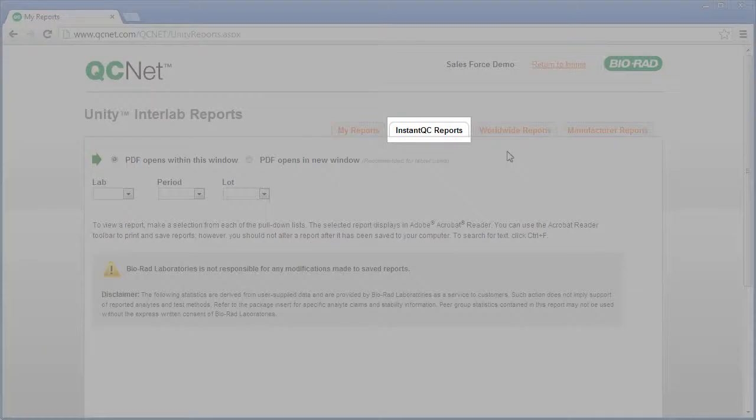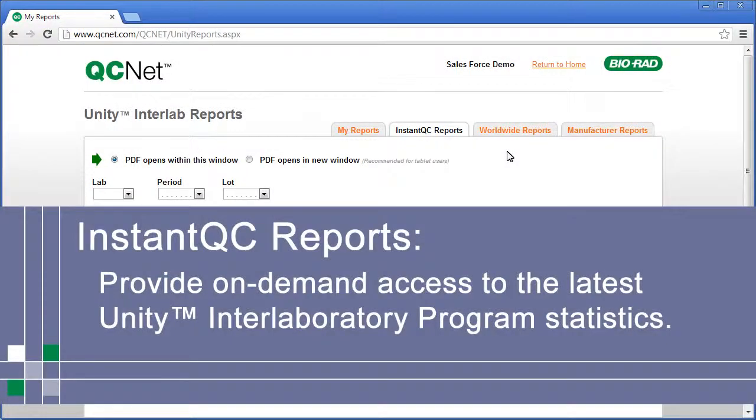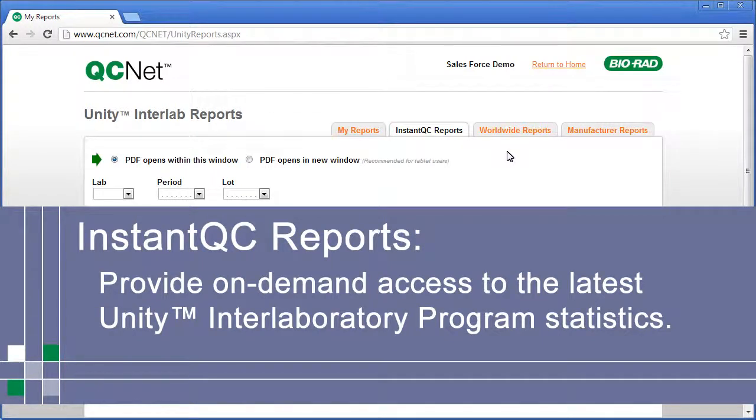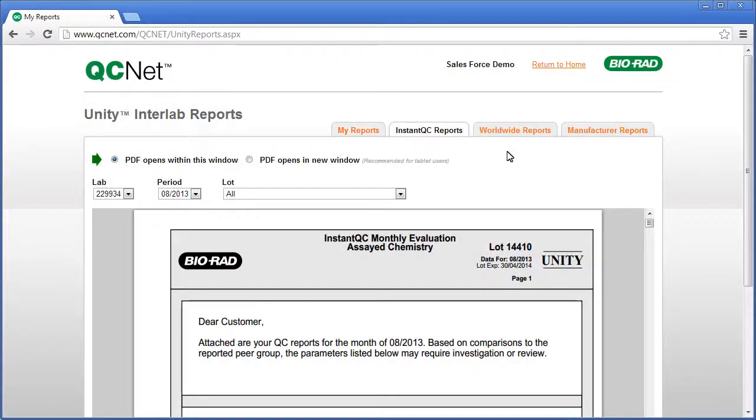Next, we'll select the Instant QC Report tab. Instant QC Reports provide on-demand access to the latest Unity Interlaboratory Program statistics. Remember, if you want more information about these reports, see module number three.